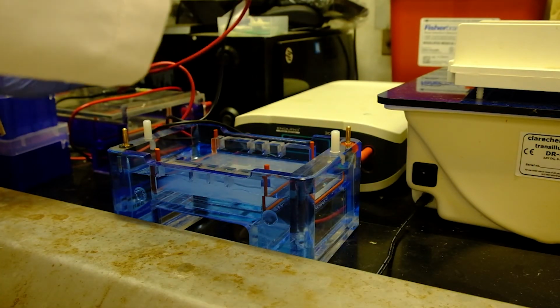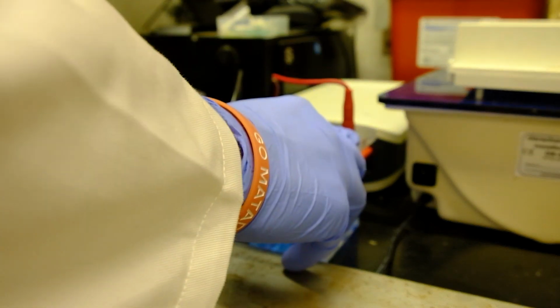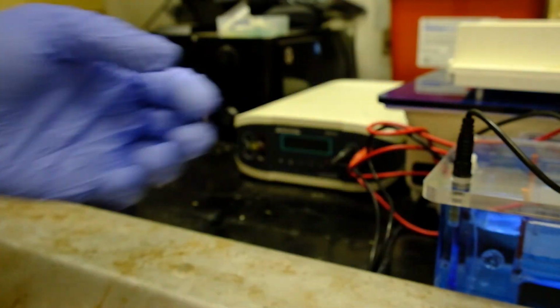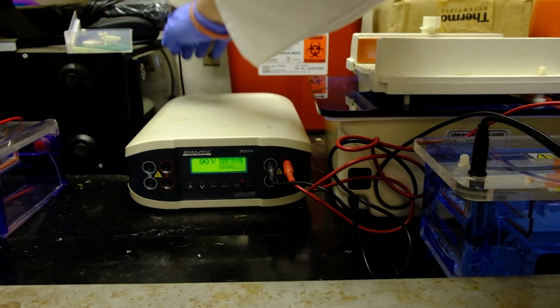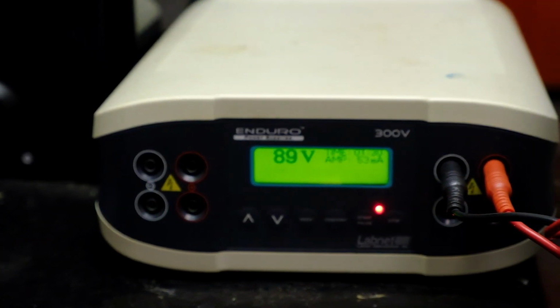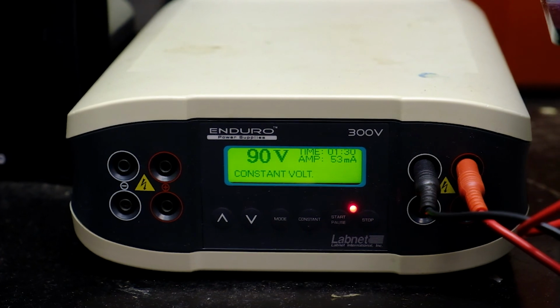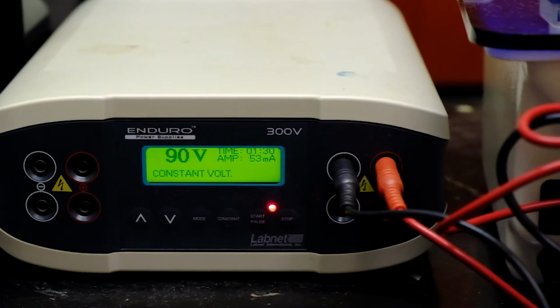Connect your electrophoresis vessel to the power supply. With most equipment, the right terminals fall in place automatically. Turn on and set up the power supply. The standard is 90 volts for 90 minutes. And make sure the power supply achieves constant voltage. Easy way to check if your gel is set up in the right direction is to remember that DNA runs away from the bubbles and it should run into the gel.